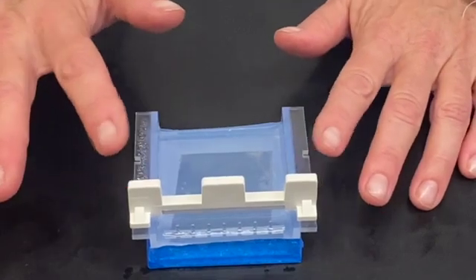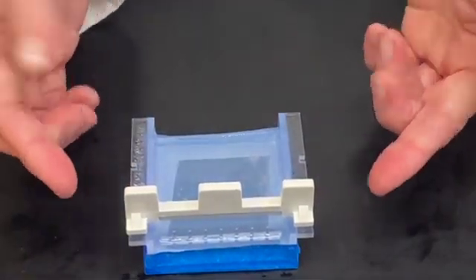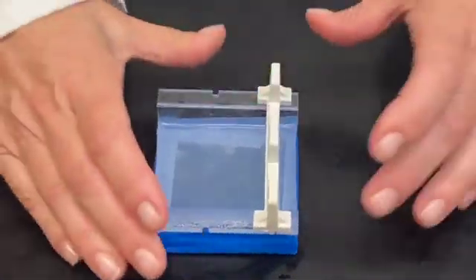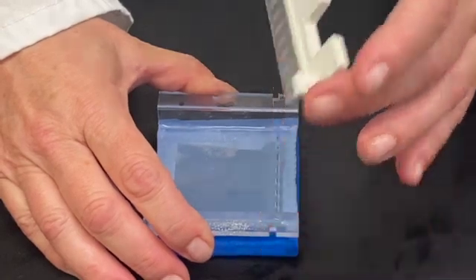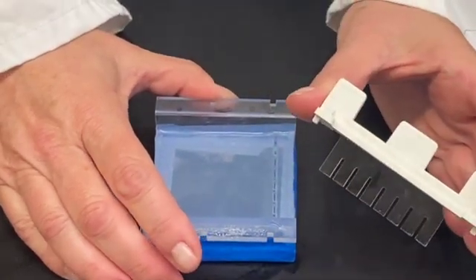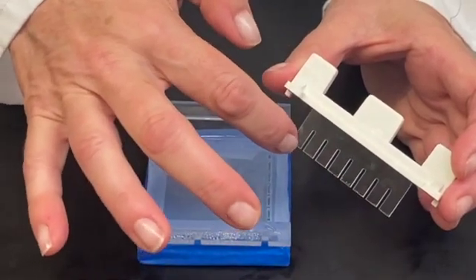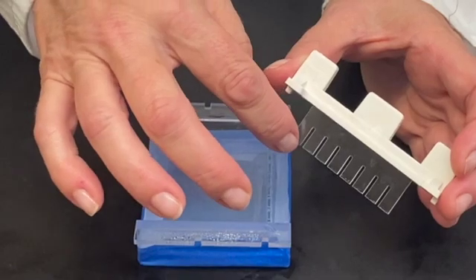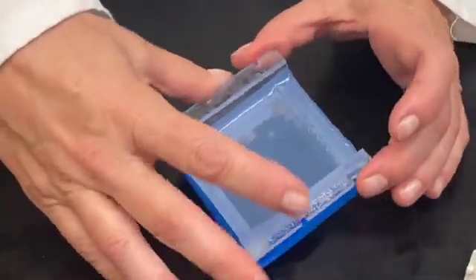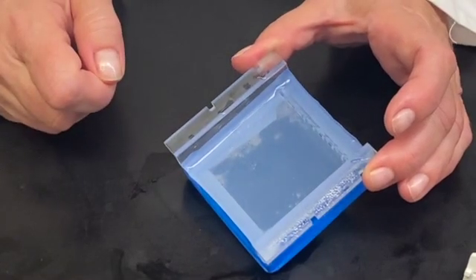The first thing that we're going to do is remove this comb, and to remove the comb we just gently lift it straight up. You can see the reason why it's called a comb is because it looks like the teeth of a comb, but they're nice and wide. When the gel is liquid this comb is put in to form these wells in the gel, and it's these wells that we're going to be putting our samples into.